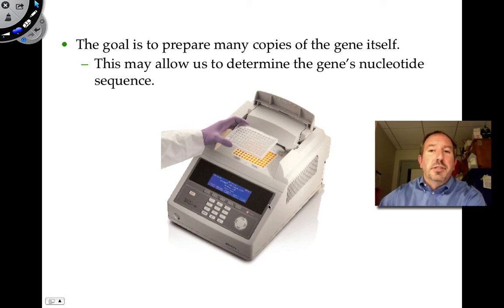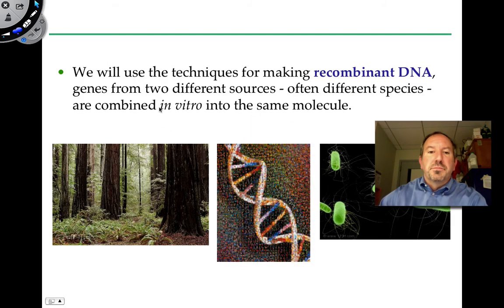It's called a thermal cycler, but it actually just changes temperatures for as long as we want it to. So it cycles between very hot, cool, and warm. Hot, cool, warm. You can program it using these buttons down below, and you can get it to do anything you want it to do. And so it's called a thermal cycler because it cycles between these temperatures.